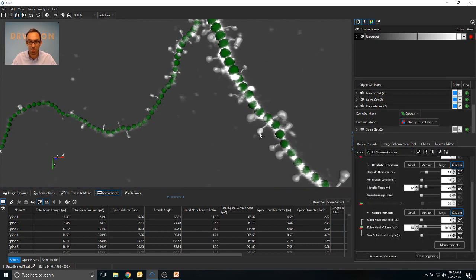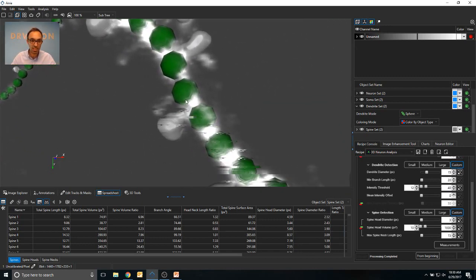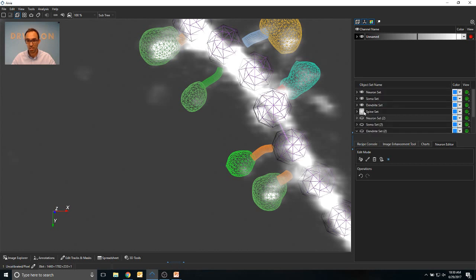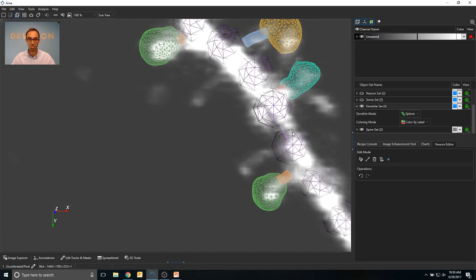And so this is what I'm doing now, just selecting one. I'm going to delete it. Delete this as well. So I just deleted these two. There they are. Well, they should be there, but I just deleted them. And now if I wanted to add them, it turned all the other things back on. So there we go. So this is the analysis that we were just looking at. I have deleted these two spines and I'm going to add them back on.